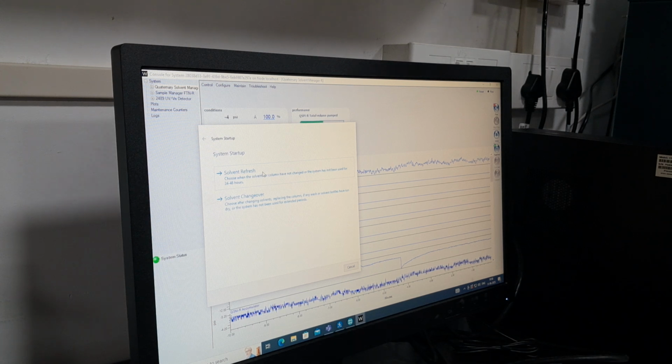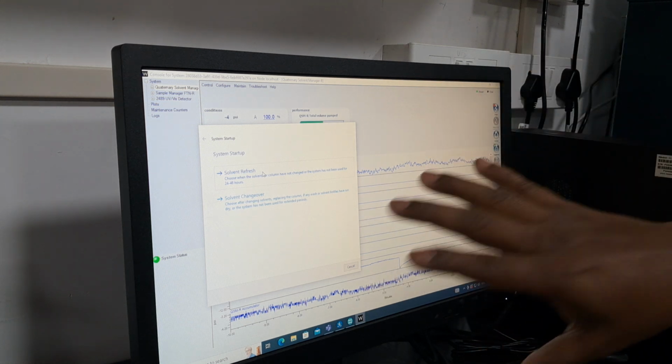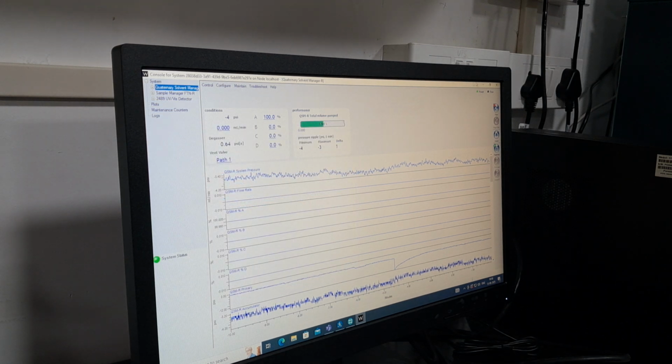Whatever the mobile phase you are keeping, the timing and everything is default actually. Only the settings, not the mobile phase. We can do it manually, 50, custom conditions, 50%. So they have set the time and the temperature, nothing else. In place of water, if you wish, you can put another composition as well. No problem, we have the control to set the parameters only, nothing else.